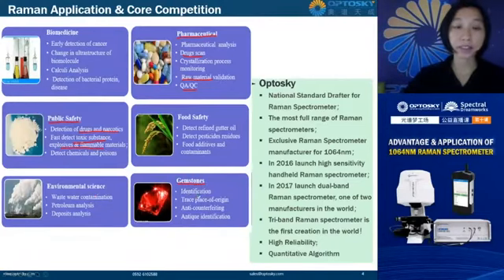It can be used to identify the place of origin of the gems, and for anti-faking and antique identification. They are also used widely in biomedicine, like early detection of cancer, calculus analysis, bacterial protein and disease detection, etc.